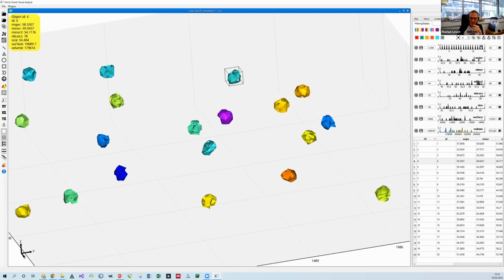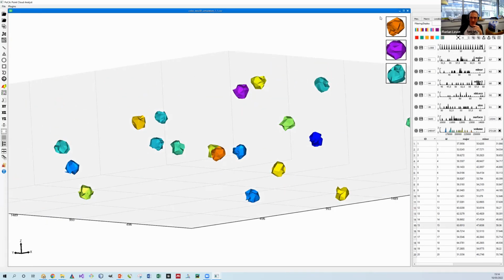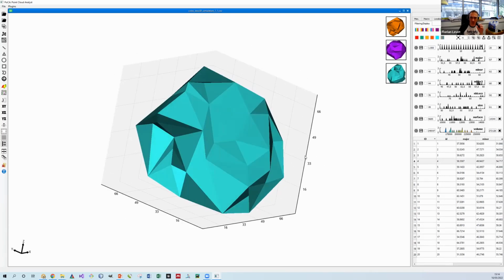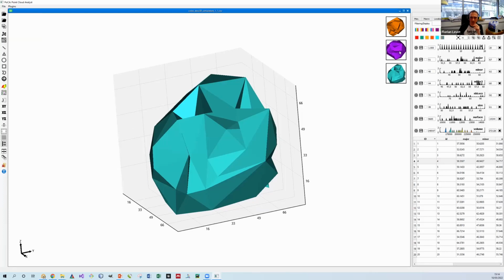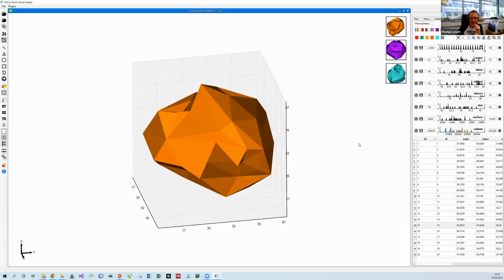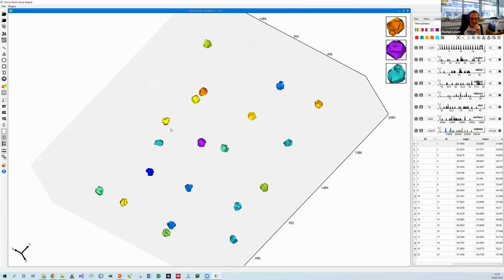and the volume. So when you are on an object like that, you can click on the right button, and you can see that it's saving your object with the current rotation. So you can do that, and then if you click on this image, it will directly go back to the object, so zoom to the object on the rotation that you have saved. So it's really helping to choose some objects and to go back to them in order to see how they are. Then you can go back to this button in order to reset the view.